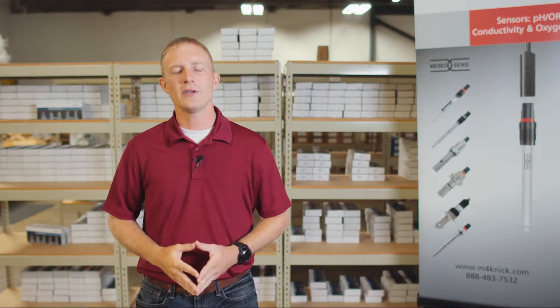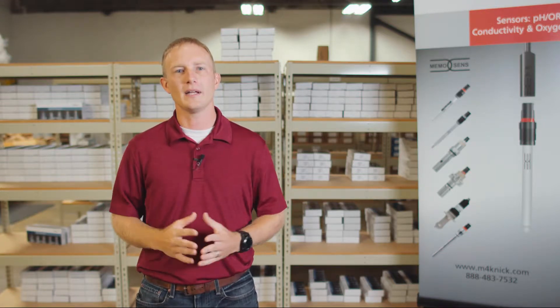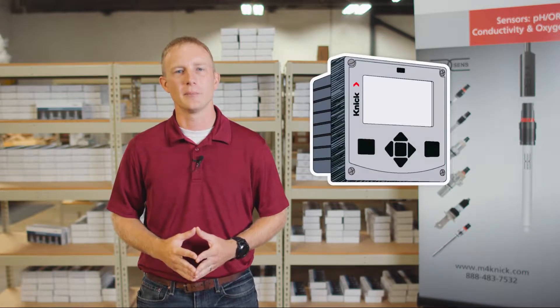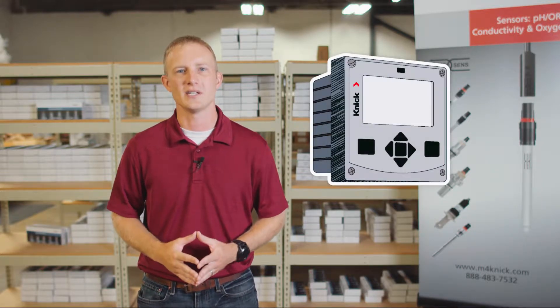Hello. This video will walk you through the steps to perform an automatic two-point pH calibration using the Stratas Evo transmitter from Kinnick with the MemoSense pH sensor.